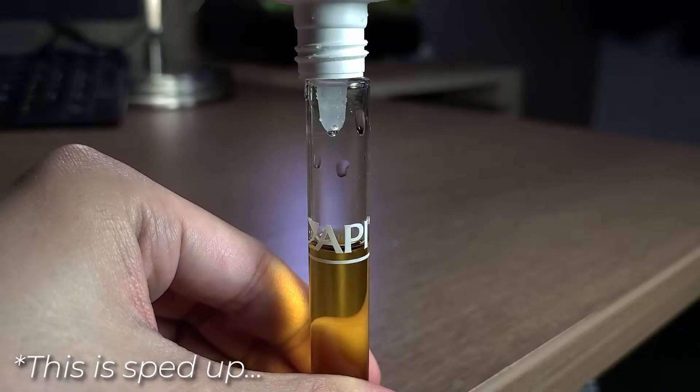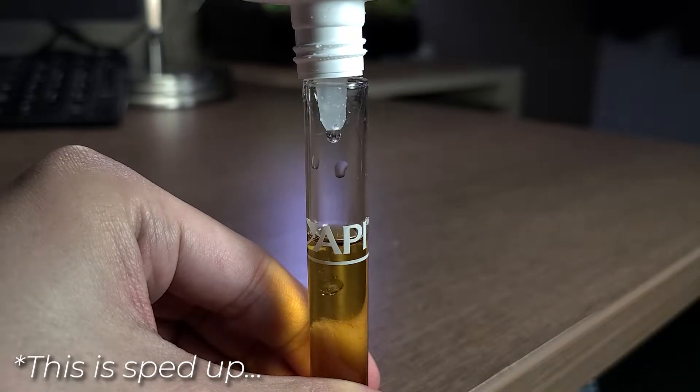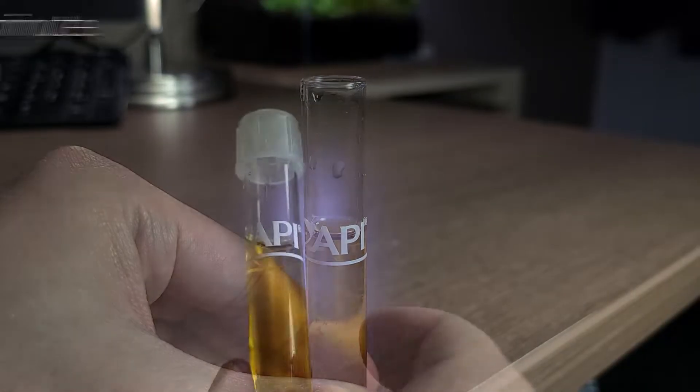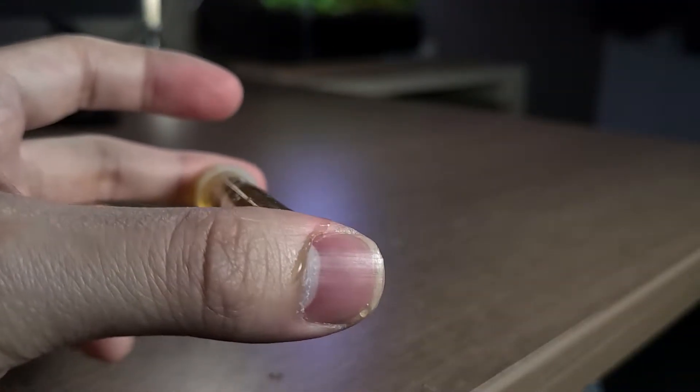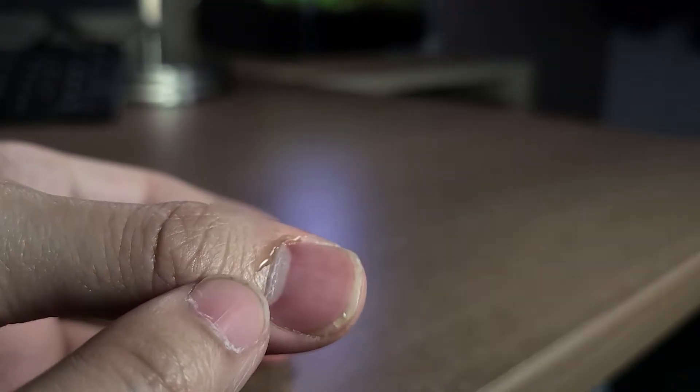Now that's done, we can add 10 drops of bottle number two to the test tube. We then need to shake it for one minute. Again, this part is also very important to ensure an accurate test result.